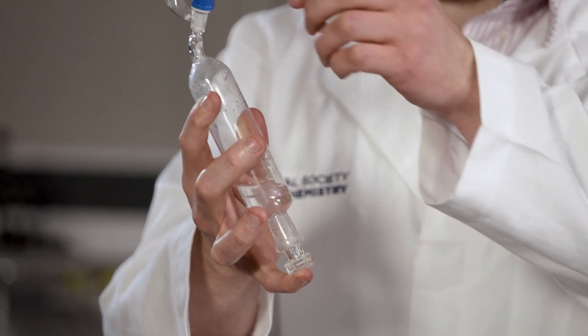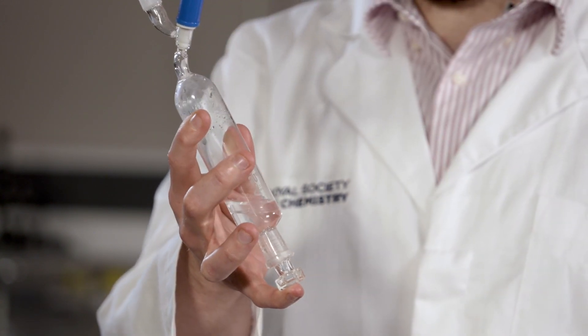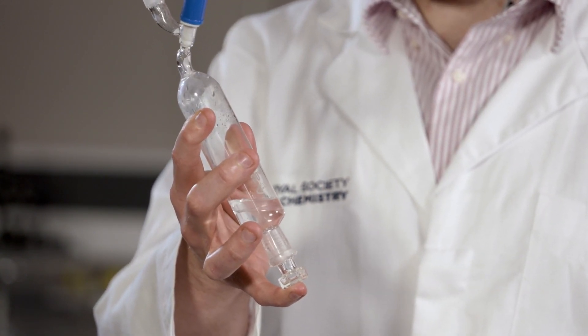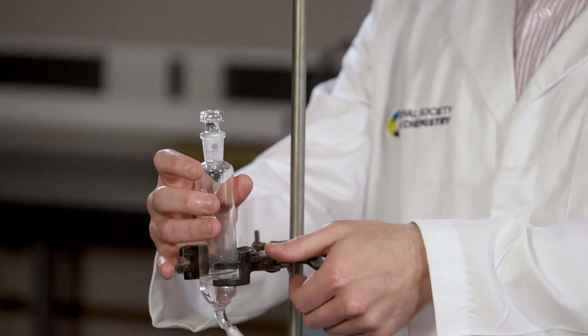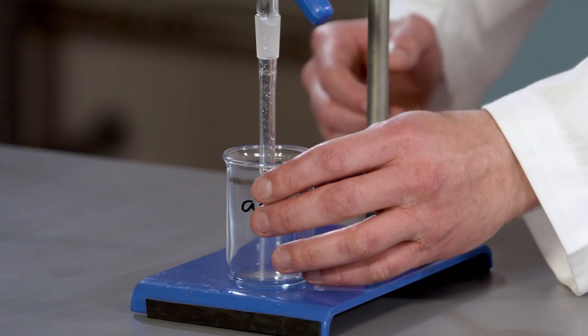We know this removal of acid is completed because the effervescence has stopped. Keeping my finger on the stopper, I'm now going to close the tap of our separating funnel and invert it again. Just like I did previously, I'm going to remove the aqueous layer.